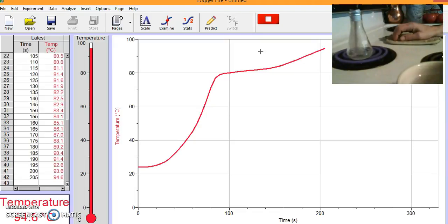What's our curve doing now? It's still moving up. Is it as flat as it was? No, but it's not as steep as it was before. It was flat or even. Okay, so it went up for a while, then it flattened, and then it's going back up again. So we still have some liquid, and we're still recording data, and our curve is doing what now?